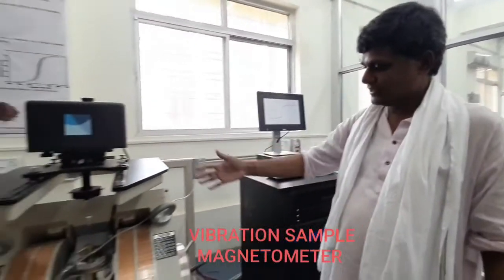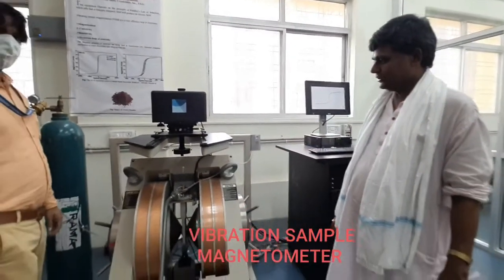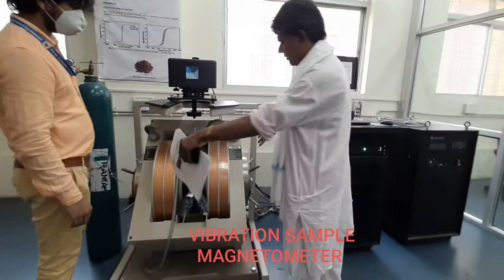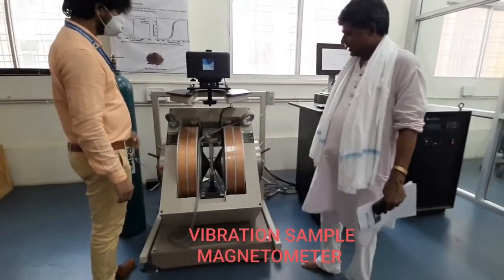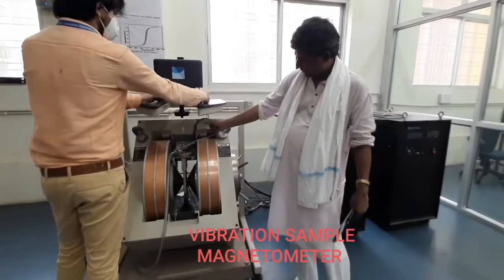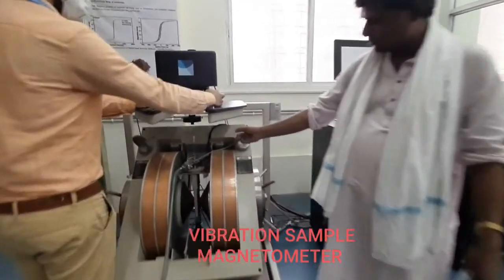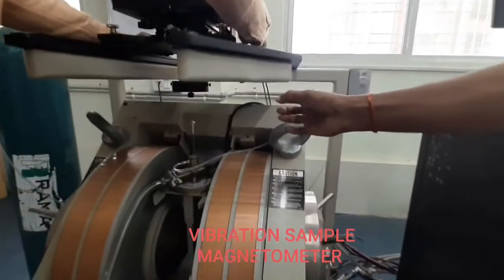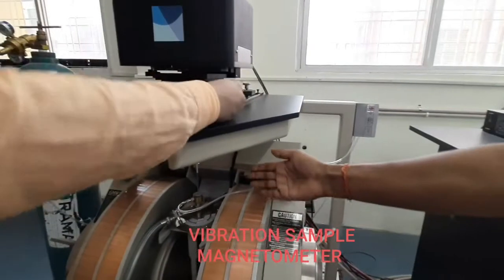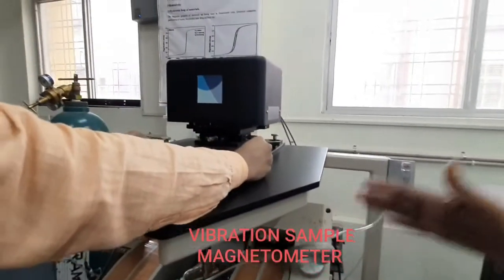This equipment is a vibrating sample magnetometer. There are two strong magnets in here, and this is the sample holder where you put the sample for magnetic measurements. The samples are connected to a screen.